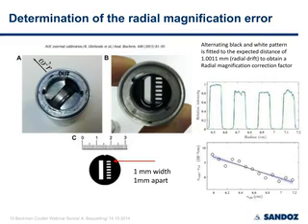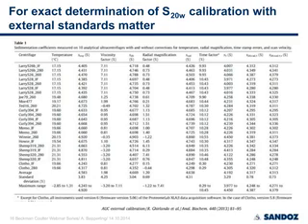Usually this is also quite small, and I'm working to make such plates, and upon request I can send you either the dimensions, a sketch of this mask, or in a few weeks, I think, also upon request, a mask itself. Okay. This is an excerpt from a publication, looking at various machines Peter Schuck tested.